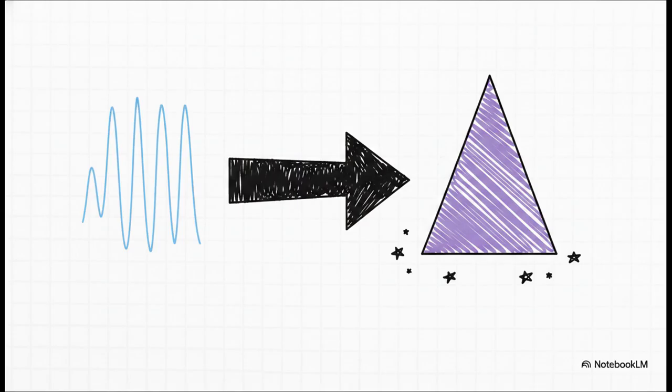To actually overcome this, modern spectrometers rely heavily on Fourier transform instrumentation, or FTNMR. This amazing tech lets chemists accumulate and add together hundreds, sometimes thousands of individual scans just to pull that incredibly weak carbon signal out of the background noise.